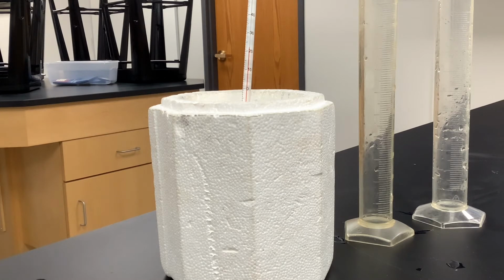As the hotter metal cube is moved to the cooler calorimeter water, heat is going to transfer from the hotter cube to the cooler water, again, until they reach the same temperature, until they're at an equilibrium.